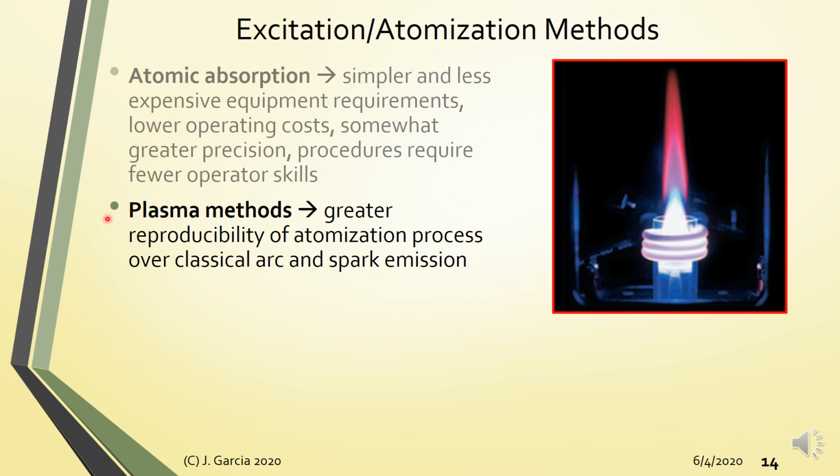ICP, your inductively coupled plasma. The full name of that is actually ICP OES, inductively coupled plasma optical emission spectroscopy, or atomic emission spectroscopy for other manufacturers. So this is how a plasma looks like.